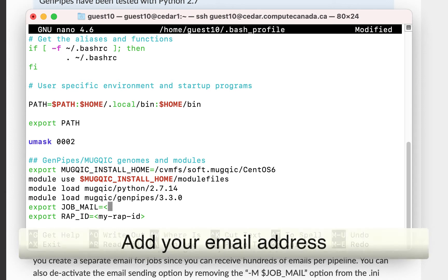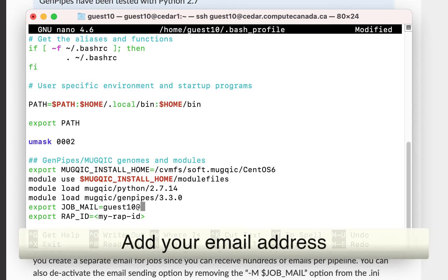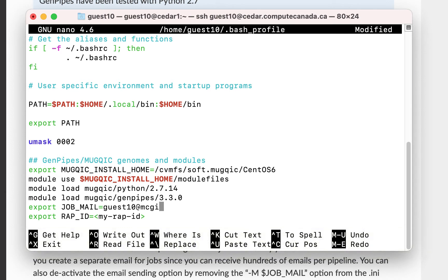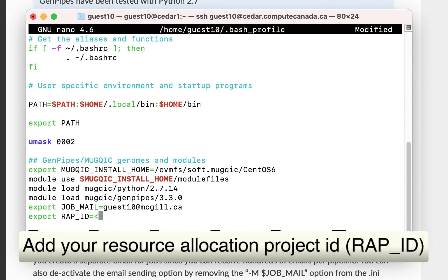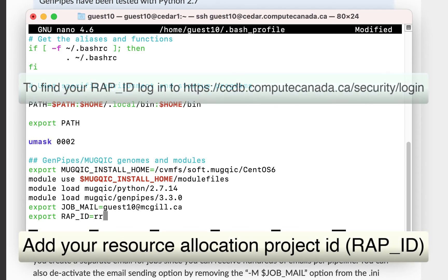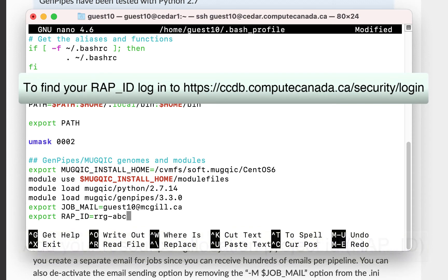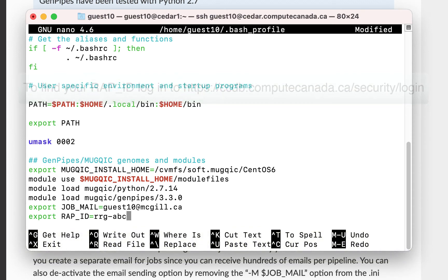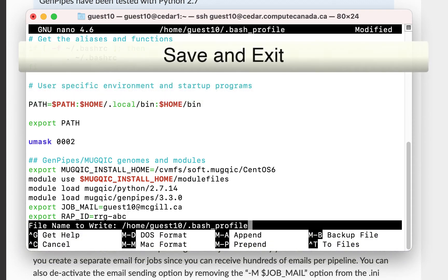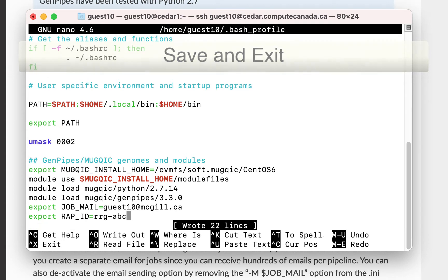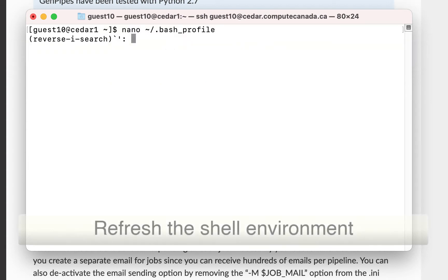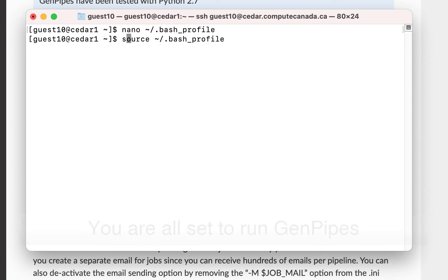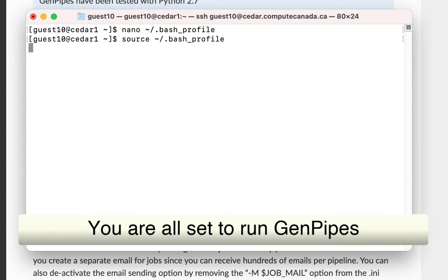Also, add your email address and it will be used to send GenPipes job status notifications. Finally, you need to include the resource allocation project ID. You can find your RAP ID by logging into the Compute Canada website. Save the changes and exit from your bash profile. Refresh the environment and you are all set to run the latest GenPipes.